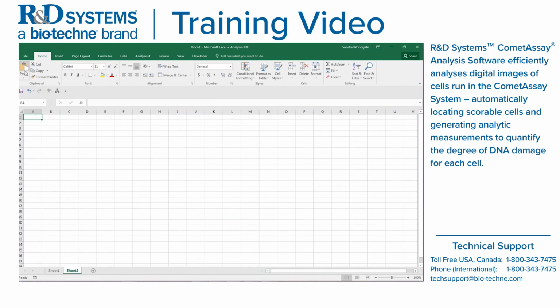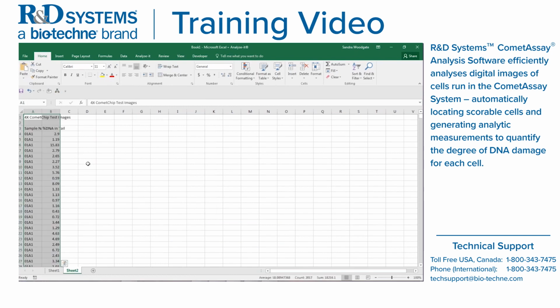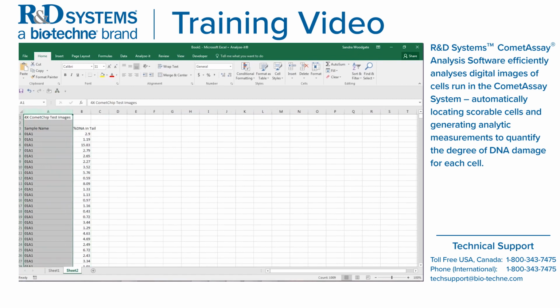All right, so the data is exported in 2 columns. You'll have the study name, and you'll have the sample name, which is basically the slide number and the well number. So these are 2 well slides. So we had the first slide 01 and well position A1.